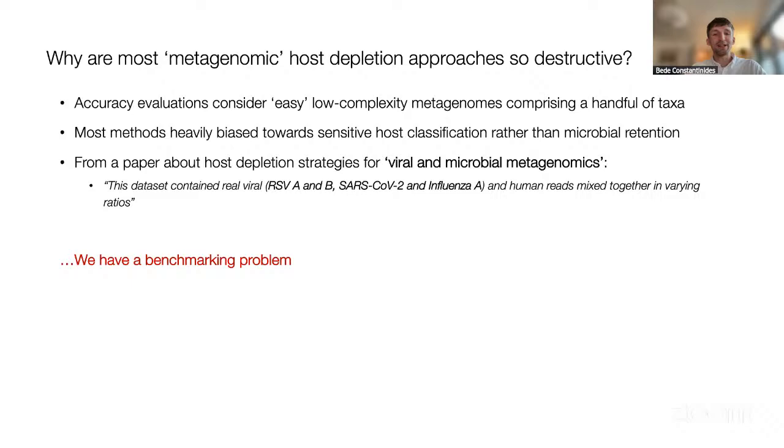So perhaps it's not surprising that they may not perform so well in that context. I think more concerning are the papers, of which there are several, which evaluate metagenomic host depletion despite only considering a handful of taxa. And I'm of the opinion that if you advertise a host depletion approach as being suitable for metagenomes in the title of that paper, you should probably evaluate more than three viral taxa and no bacterial taxa, as in the case I'm thinking of, which I've quoted a little part of here. So as a result of quite limited benchmark data sets, the sensitivity and specificity trade-offs for many tools are, in my opinion, quite problematic.